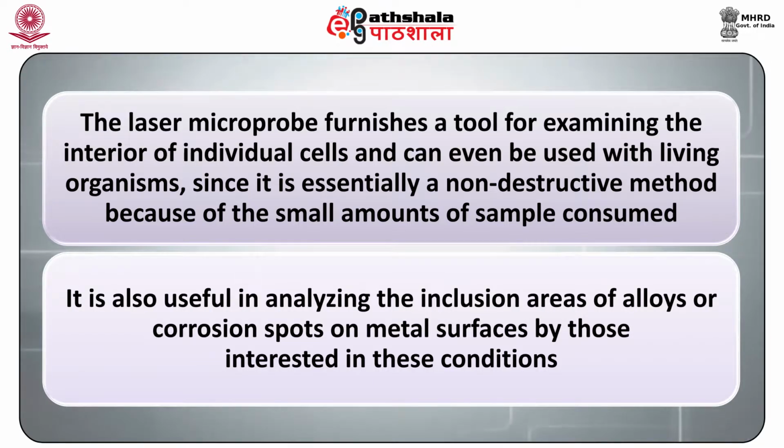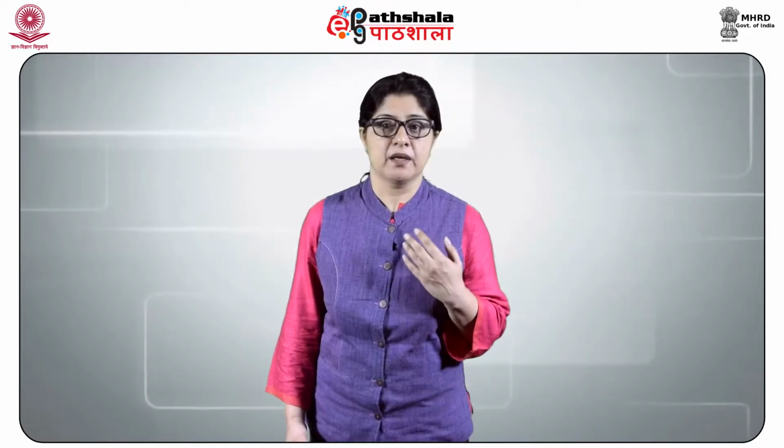The laser microprobe furnishes a tool for examining the interior of individual cells and can even be used on living organisms. Since it is essentially a non-destructive method because of the small amounts of the sample consumed, it is also useful in analyzing the inclusion areas of alloys or corrosion spots on metal surfaces by those interested in these conditions. Resolution of the laser beam is currently limited to 50 micrometers by the lenses used to focus the laser beam.